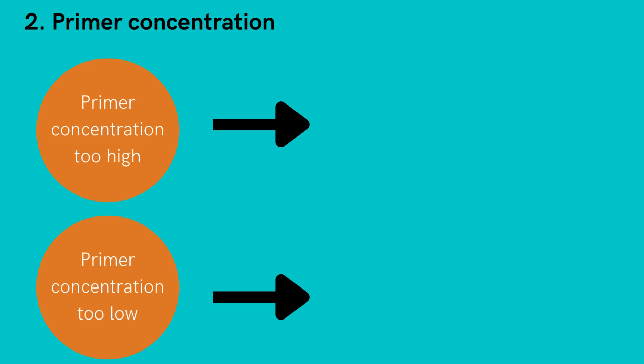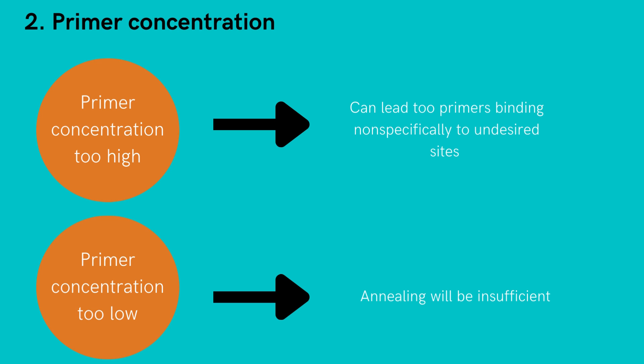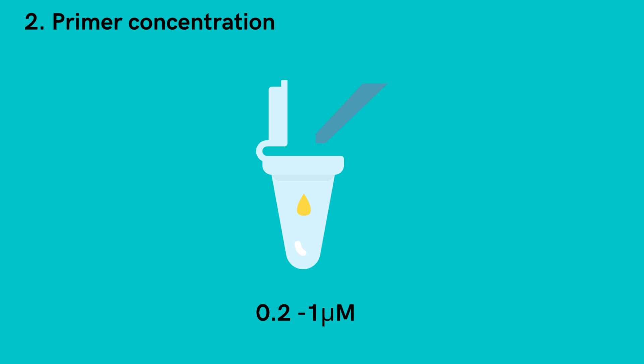Next, primer concentration also leads to weak or faint bands. If the primer concentration is too high, this leads to primers binding nonspecifically to undesired sites on the template or to each other. And if primer concentration is too low, this can lead to insufficient annealing. In order to combat this, well-designed primers are at a concentration of 0.2 to 1 µM. Also, it is important to make sure that correct concentrations are supplied by the manufacturer.